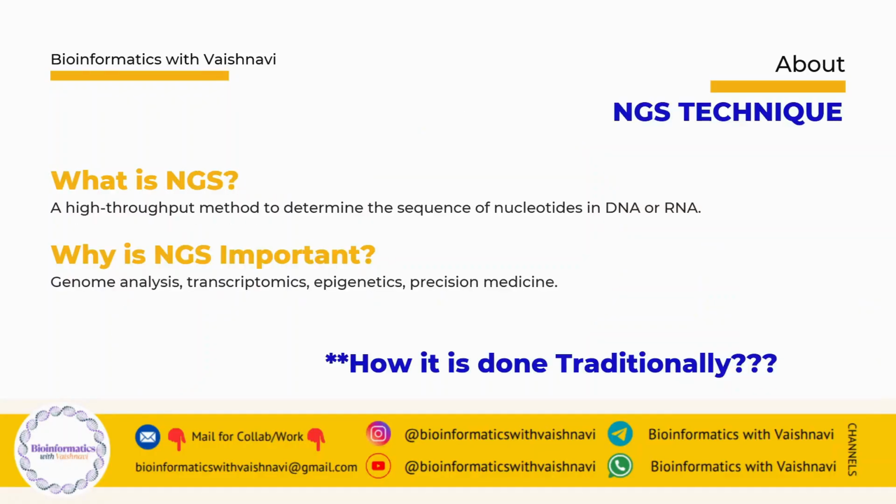So let's start. NGS stands for Next Generation Sequencing. It is a high throughput sequencing technique, which means it can sequence millions of DNA and RNA fragments simultaneously. Unlike older methods, NGS allows us to generate a huge amount of sequence data in a single experiment.